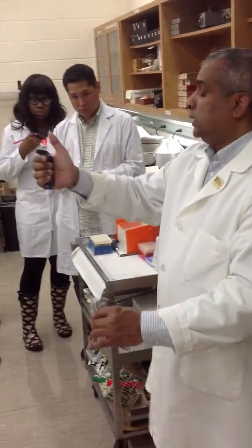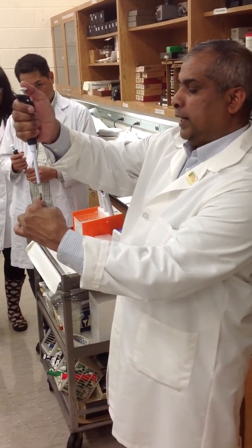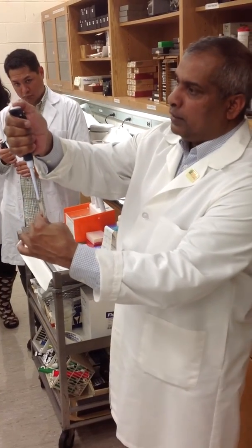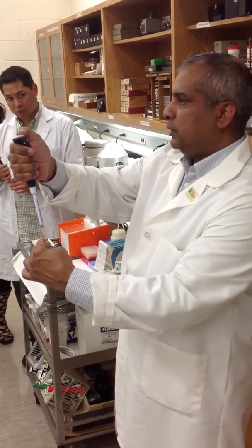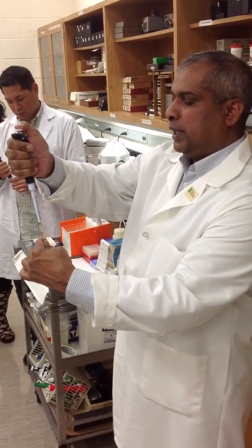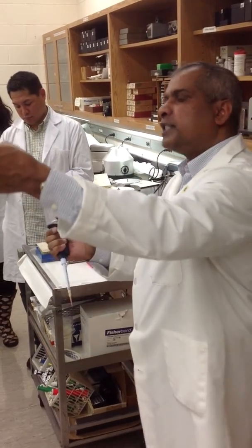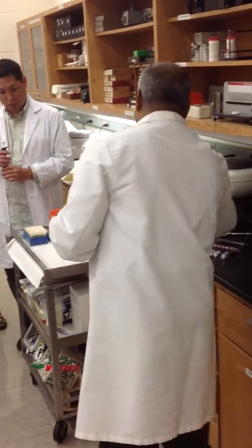So put it in and squeeze. Make sure it all goes in. Then you press the extra little bit on the plunger, and that will make sure that everything in here is dispensed in here. And of course, there's the eject button on that.